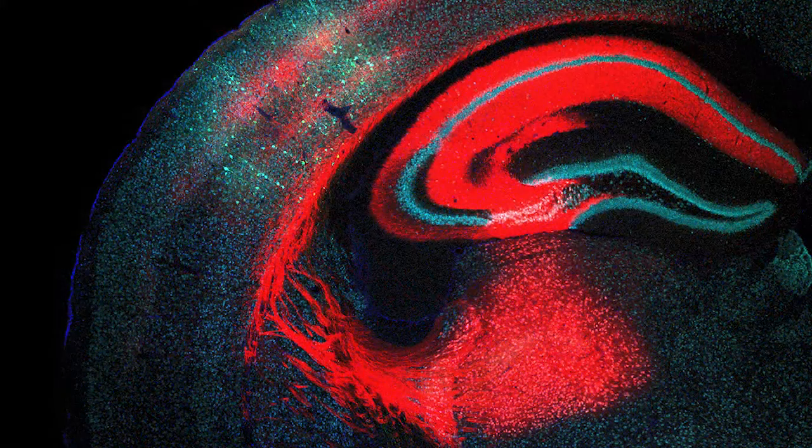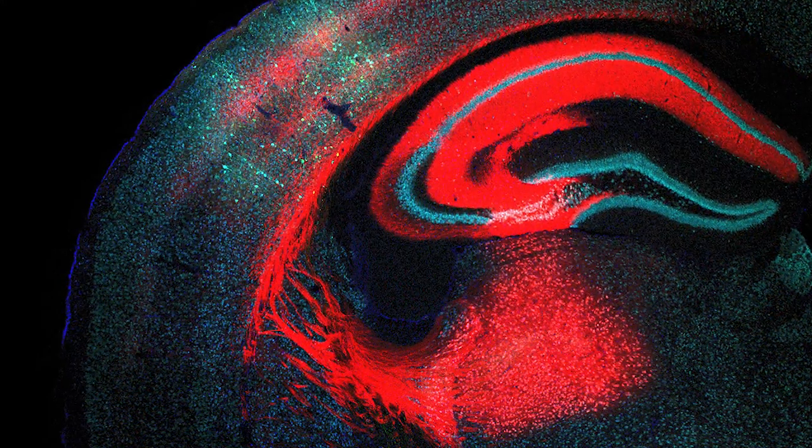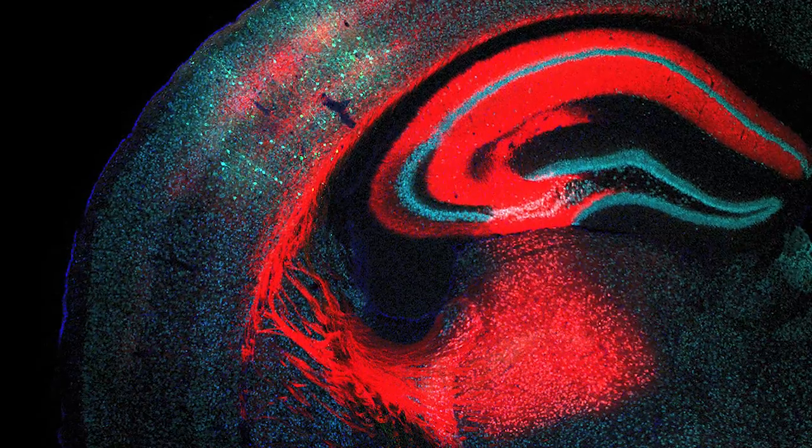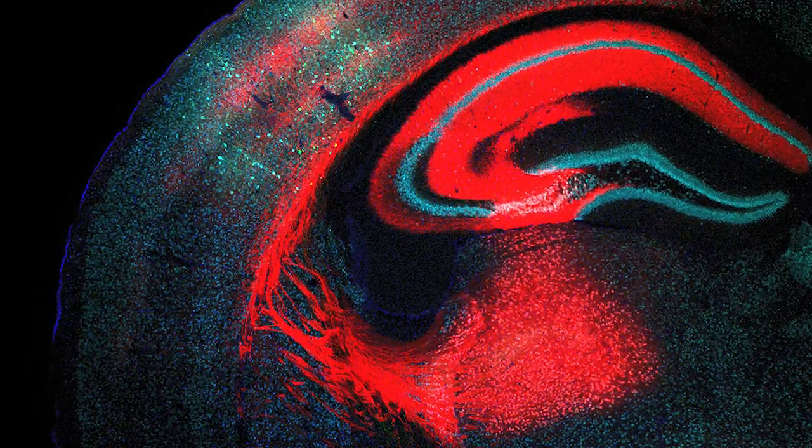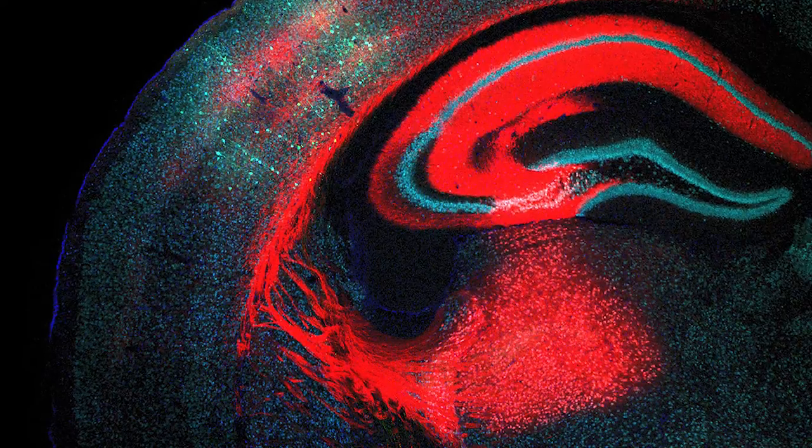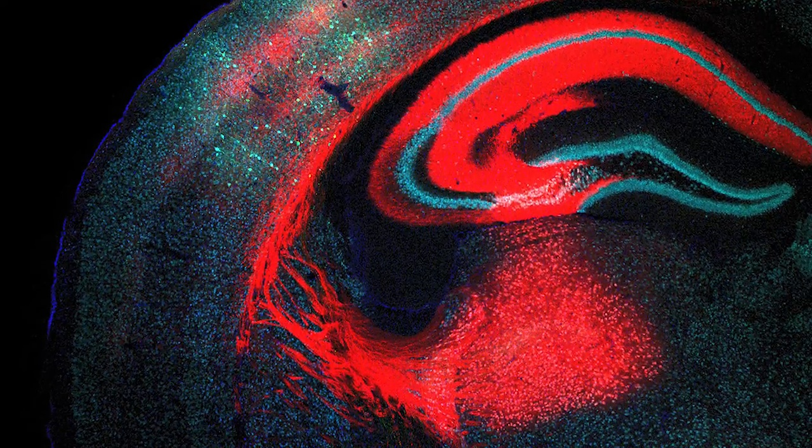The one thing that we must be careful about is that we don't have many color options for fluorescent dyes. You always have four dyes, and you have to be very careful what color goes where, because you also want to see when some of these structures overlap, and the resulting colors are also something that you'll see.